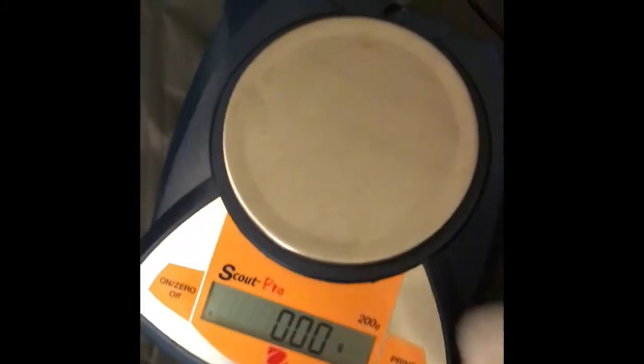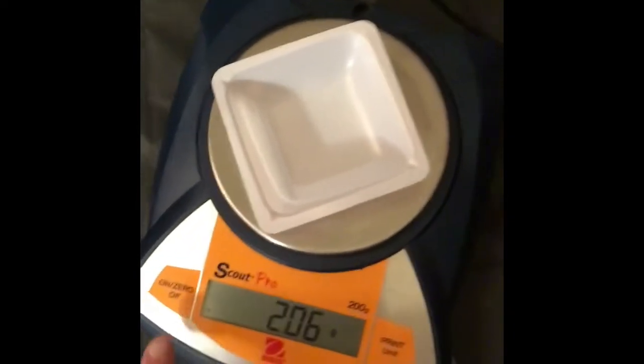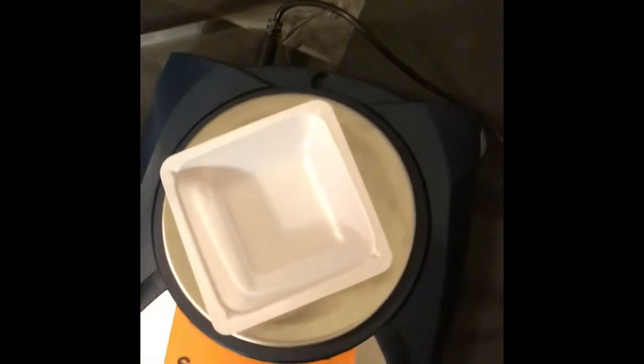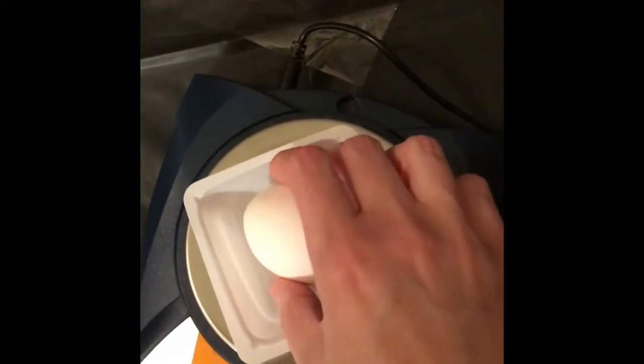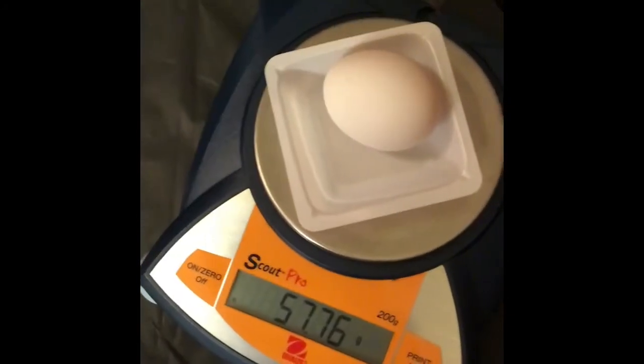The first thing I'm going to do is find its mass. I'm going to move over to my balance and set my weigh boat down. That's just the dish that I'm going to use to hold the egg still. I'm going to zero it out so that it doesn't include the mass of the weigh boat, and then I'm going to take the mass of my egg.